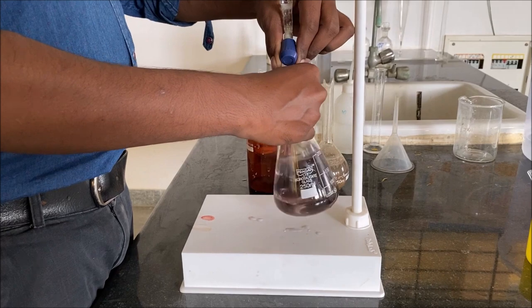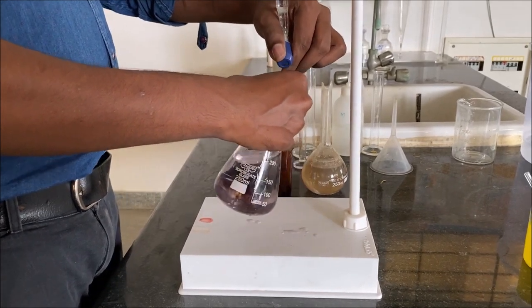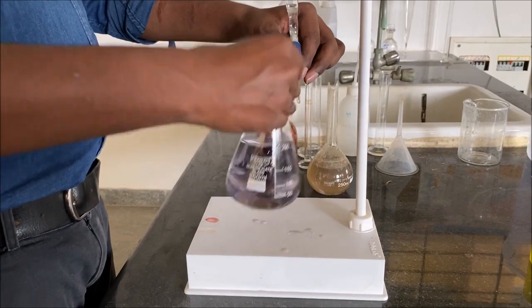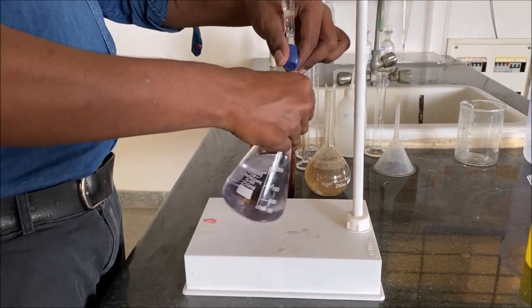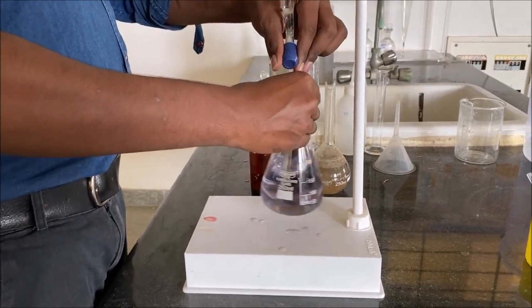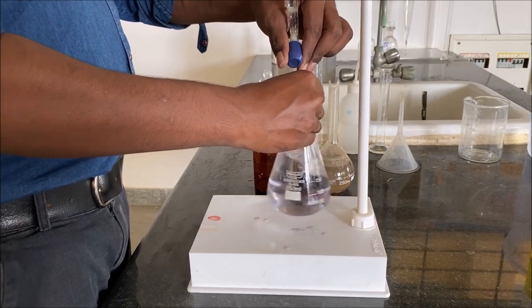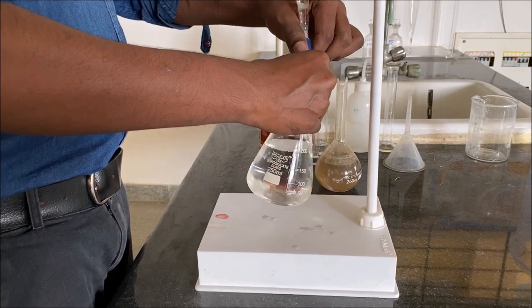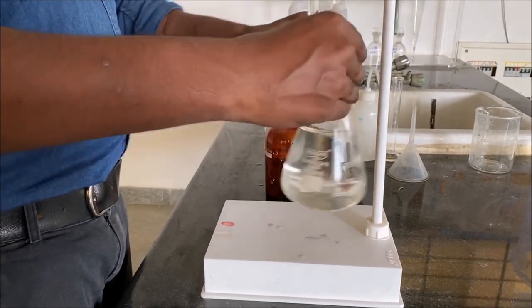Now it is readily visible that the blue solution is gradually turning colorless, but we have to titrate until the solution is completely colorless. So now the solution has turned completely colorless.